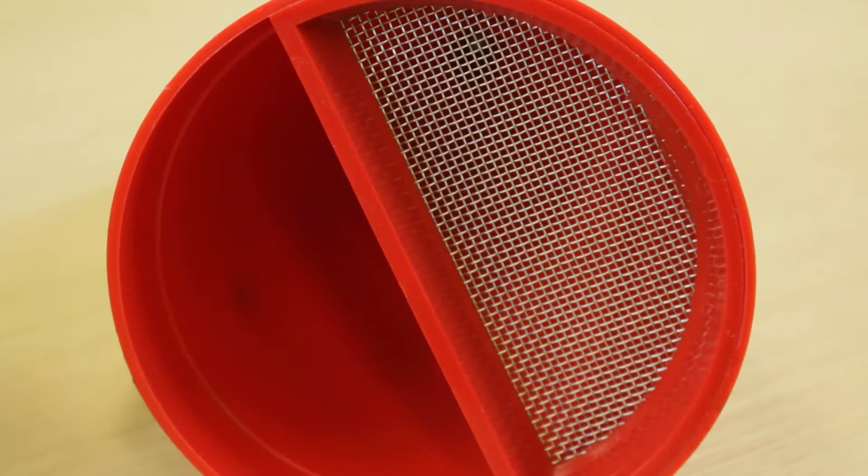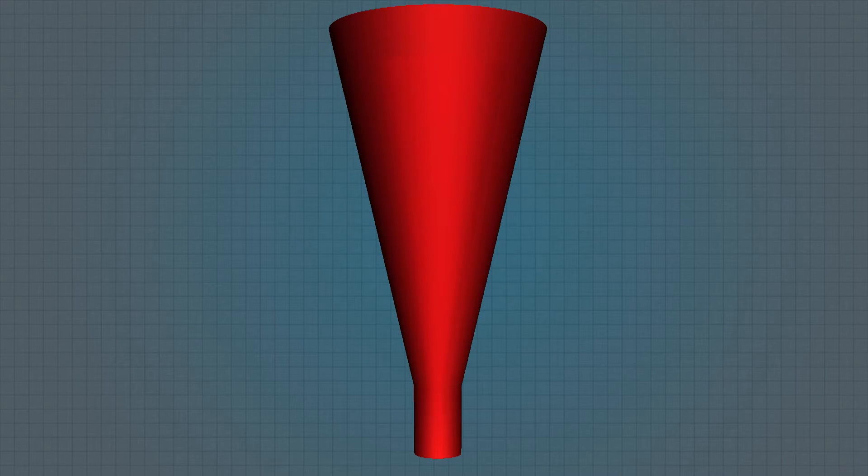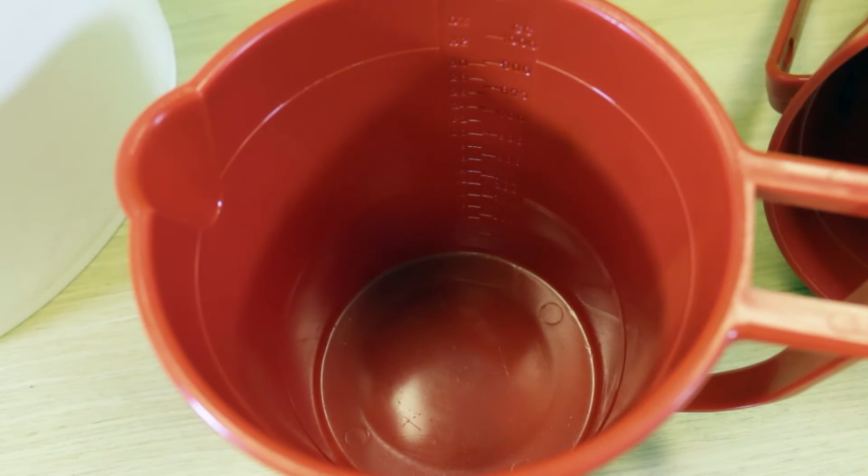When we test the fluid, we will first fill the funnel to the line just below the screen. We will then measure the rate or length of time it takes for the drilling fluid to flow out of the funnel to the one-quart line near the top of the measuring cup. The cup is graduated and the one-quart line is marked.